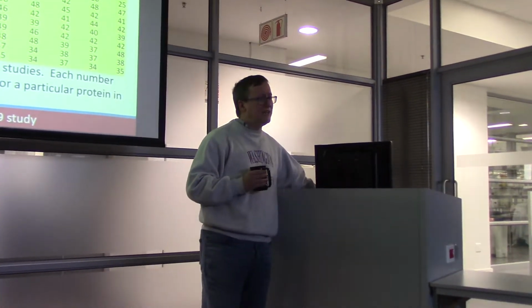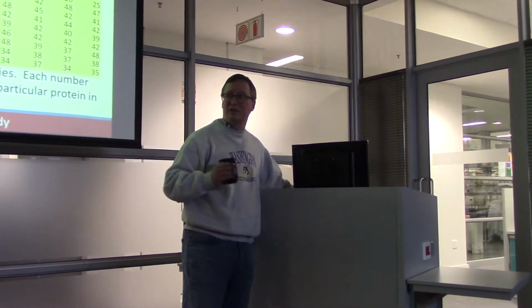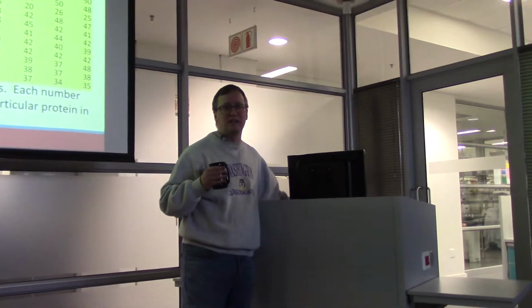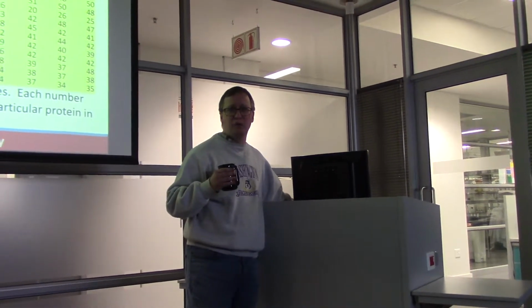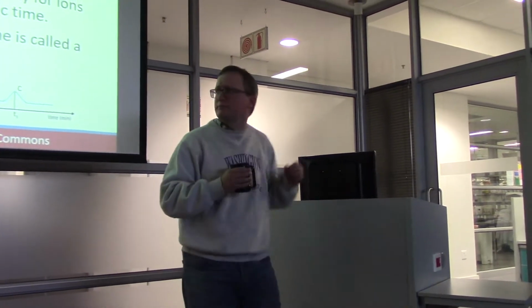So I'm not really going to talk a lot about the statistics on how to do this at the moment, but you should be aware that the question of how you turn a table like this into decisions about which proteins are changing is a complex place to work. All right.